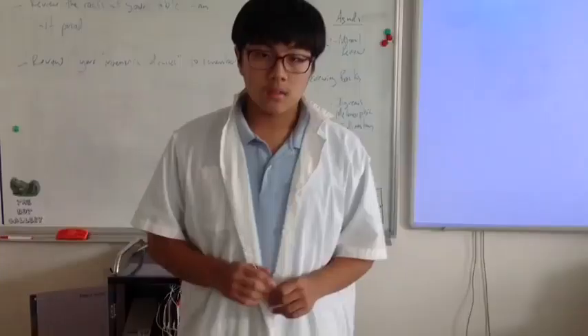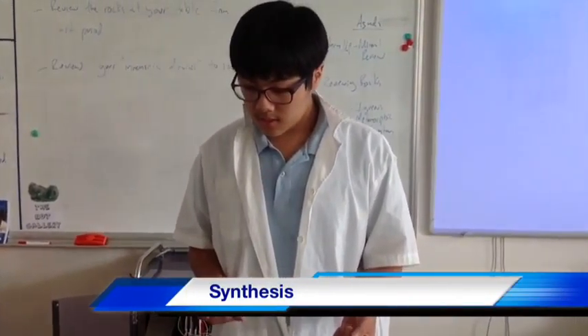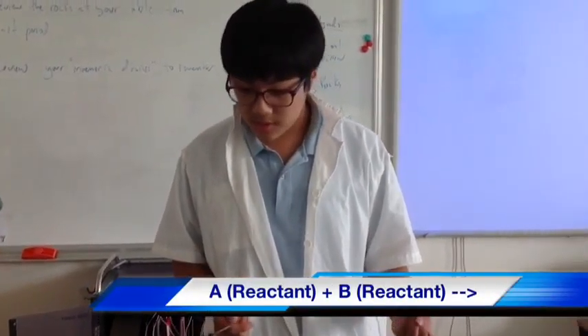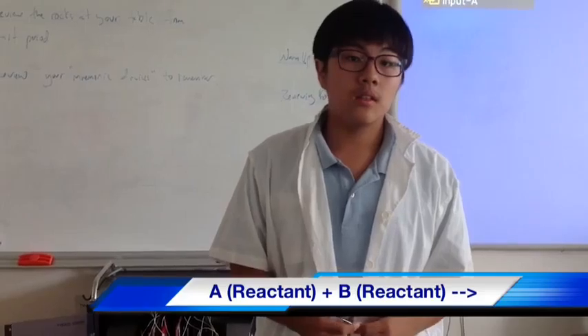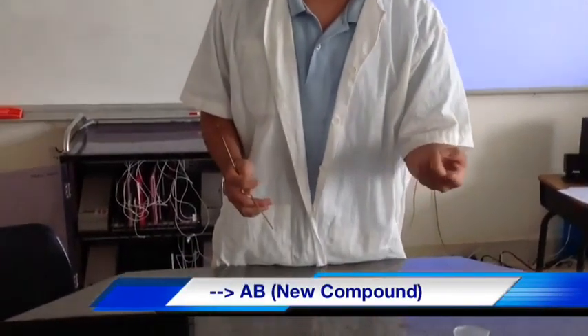And that concludes the experiment. The experiment we just did was called synthesis. Synthesis is combining two different elements to make a new compound. So we mixed iron and oxygen together to make iron oxide, which was rust.